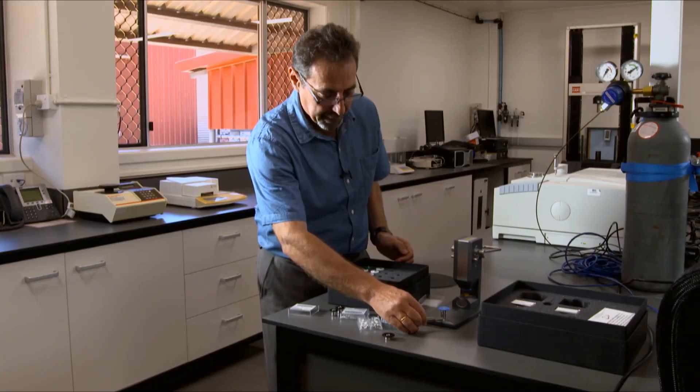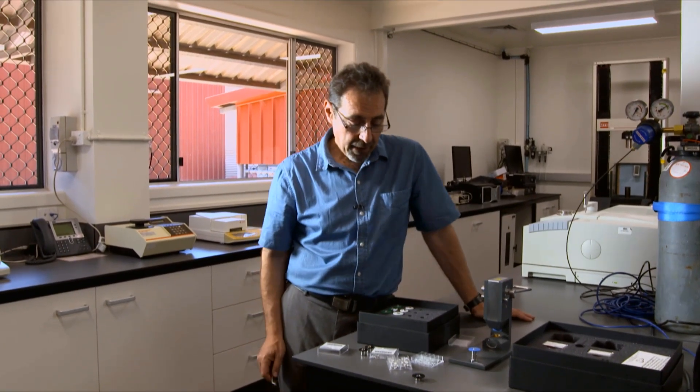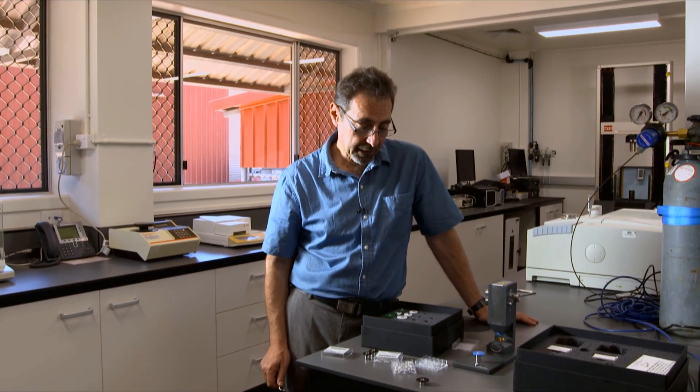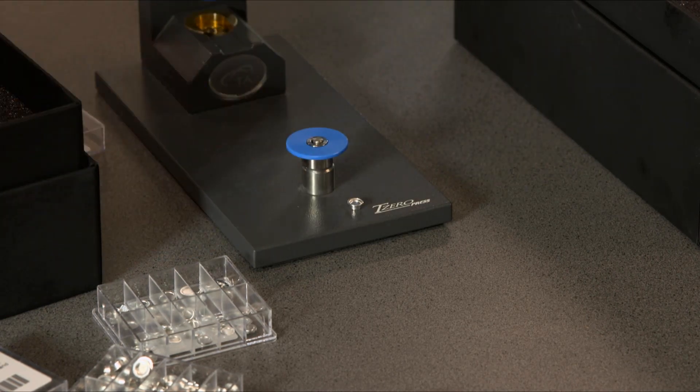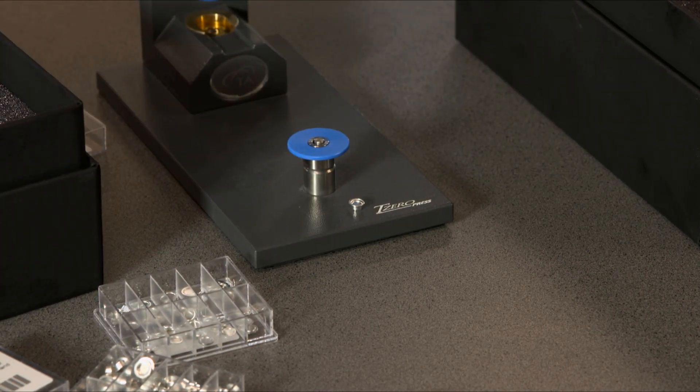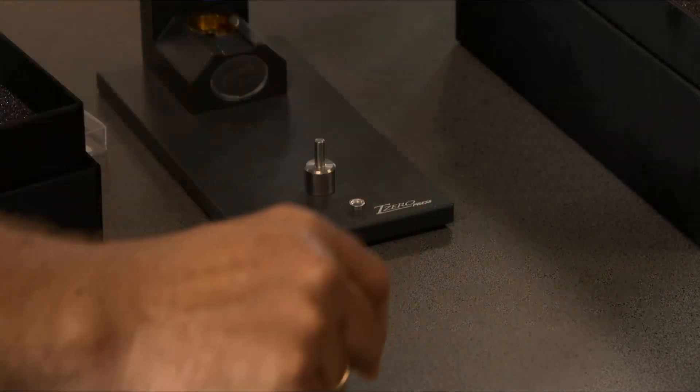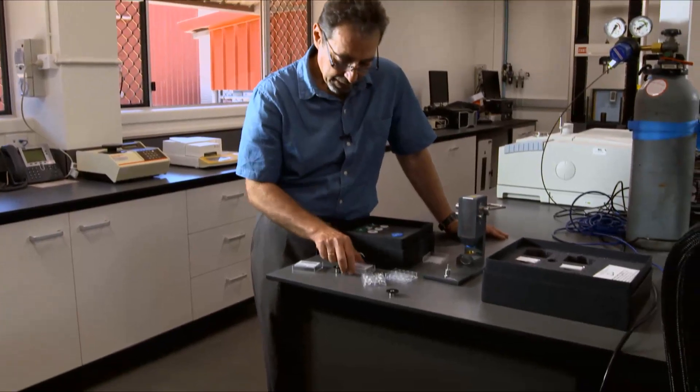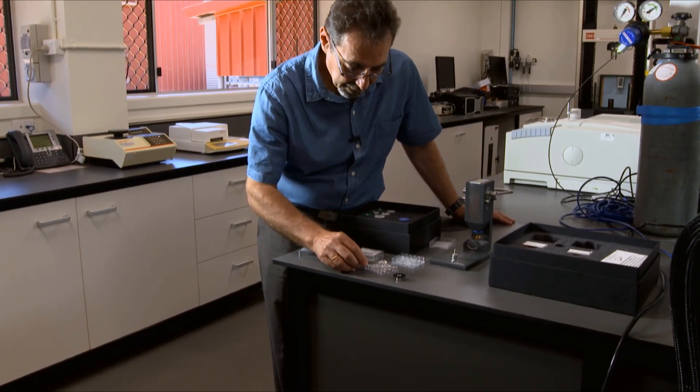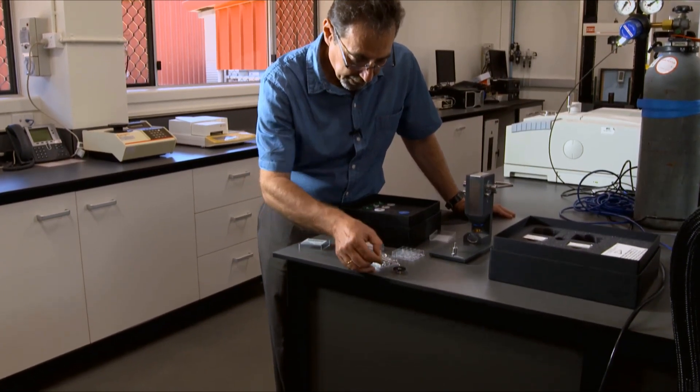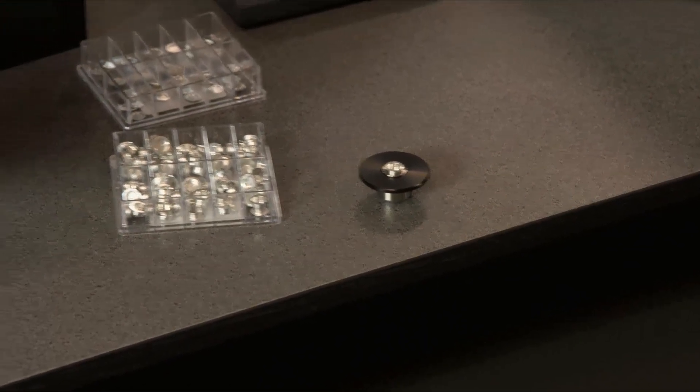Now hermetic pens are used for samples which are liquids, gels, paste, so that you do not squeeze your sample out of the pen when you crimp it. When you work with polymers, you will more often use standard T0 lid. Now we are going to make reference T0 pen.